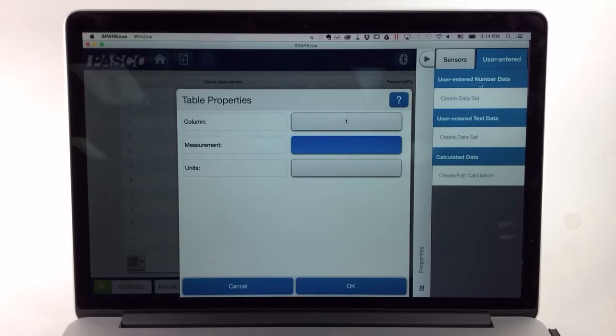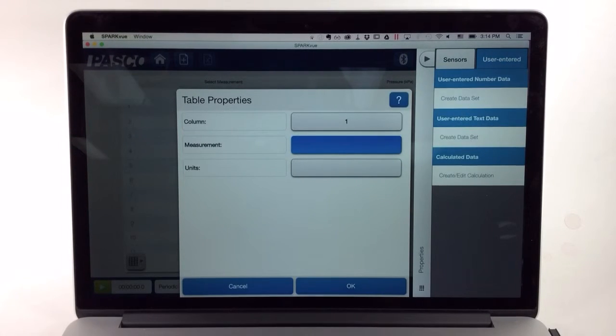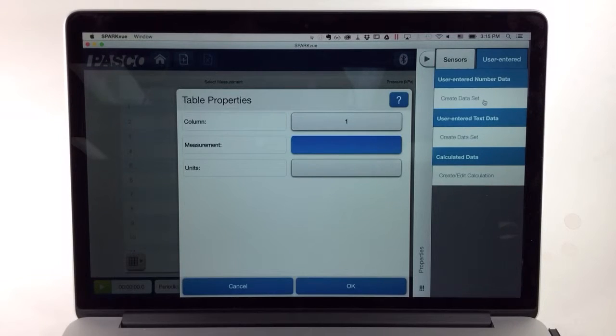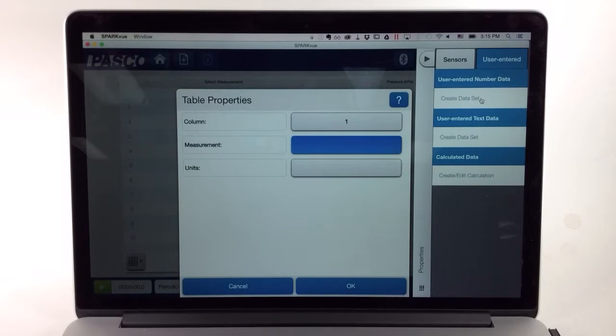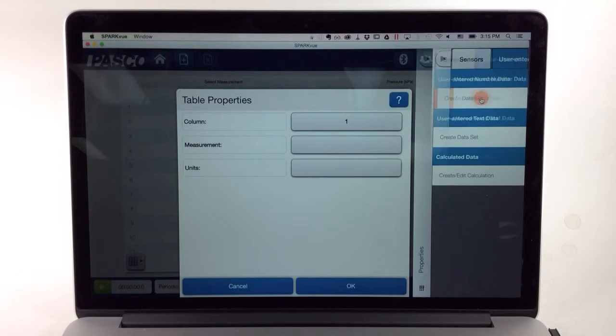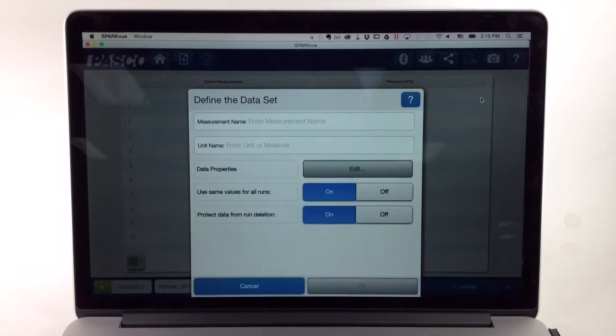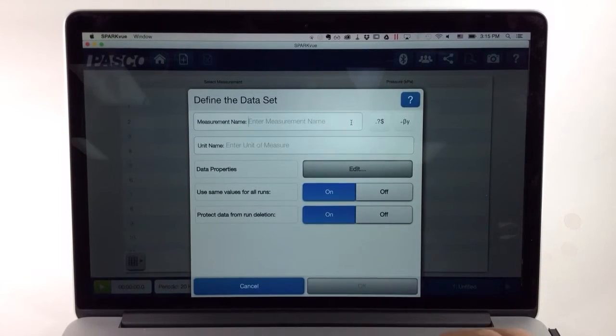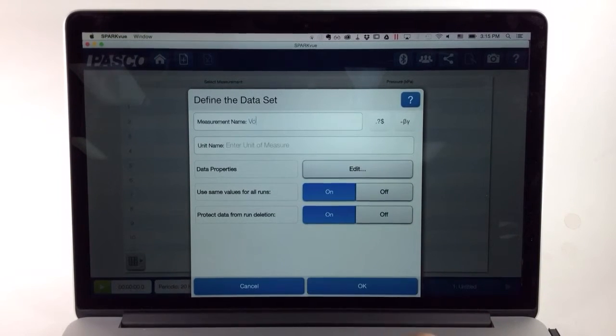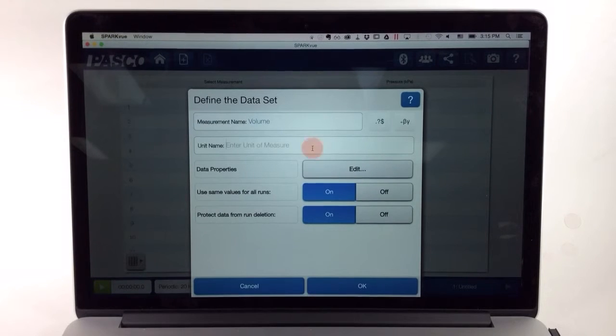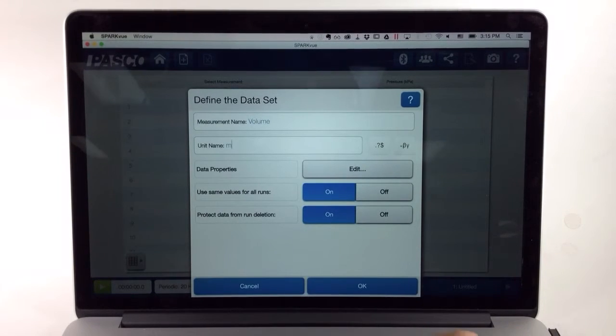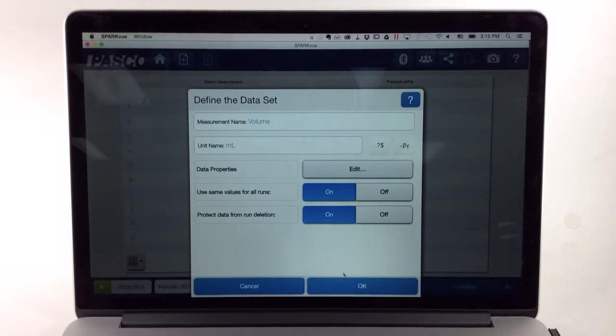I have a choice between user entered number data or user entered text data. In this example, these will be numbers read from the syringe, so I'll choose User Entered Number Data and create a data set. I'll need to define the measurement name, which I'll call Volume, and the units. I'll choose milliliters so I can read it directly off the syringe.